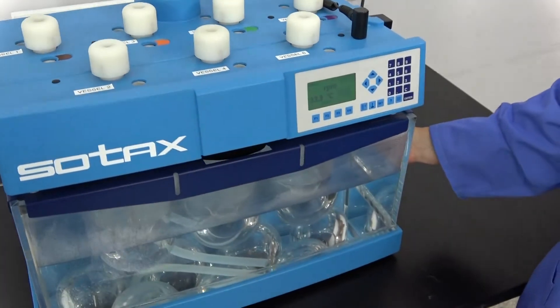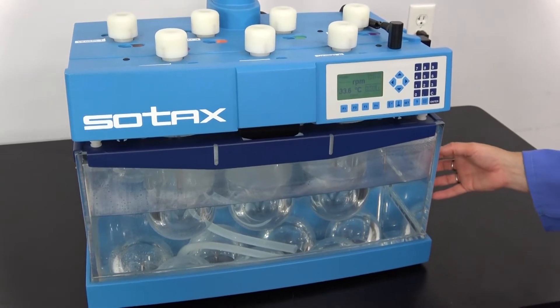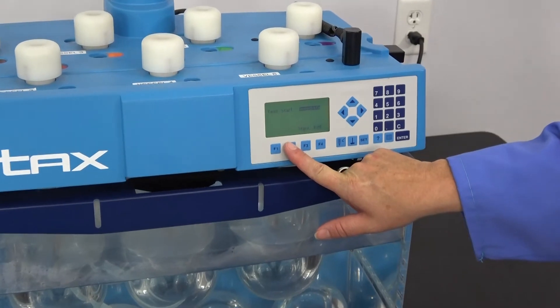It does come with a heater for the water bath which is extremely helpful for pharmaceutical applications. We're going to go ahead and start it up so you can see it running.